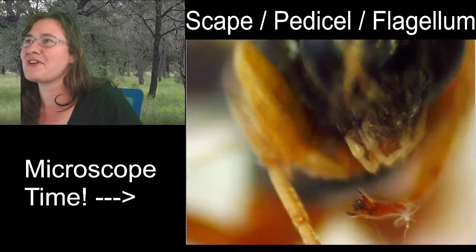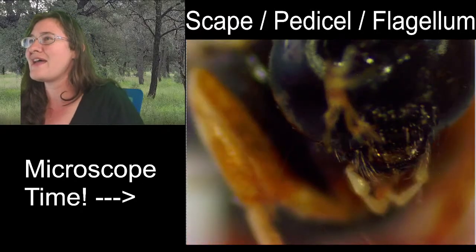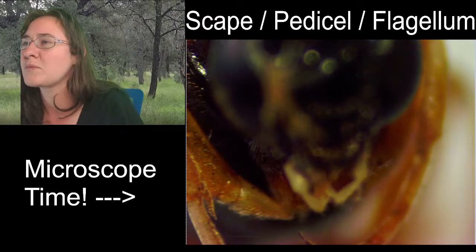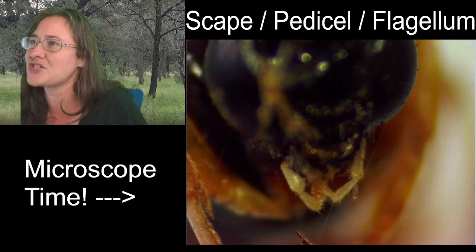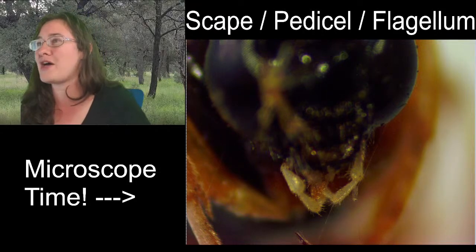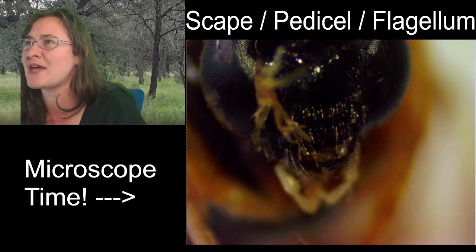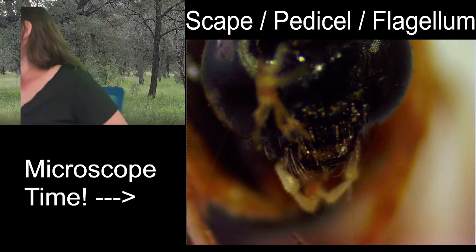The thing about having an insect that's so little is that you move it only an itty-bitty bit, and it moves all the way across the screen. There we go. You know, I think some of our mouth parts are going to be actually easier to see from the side, but I wanted to look at these golden labial palps. I was hoping that we were going to be able to see the mandibles from here. But I don't think that we can.